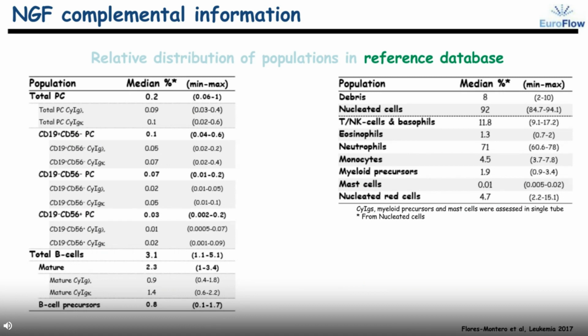We can establish the quality and representativeness of the sample based on normal bone marrow associated populations, identify related or unrelated hematologic conditions coexistent with the minimal residual disease, better understand the biology of the disease, or ultimately, identify potential biomarkers with prognostic significance.